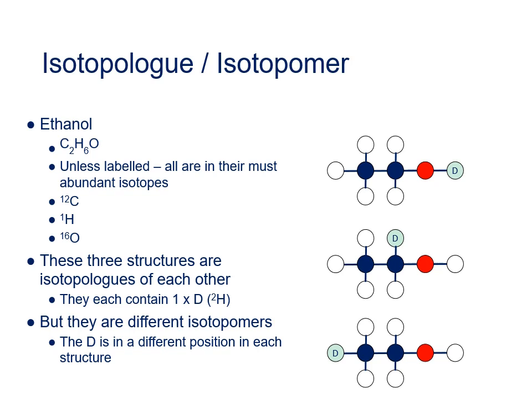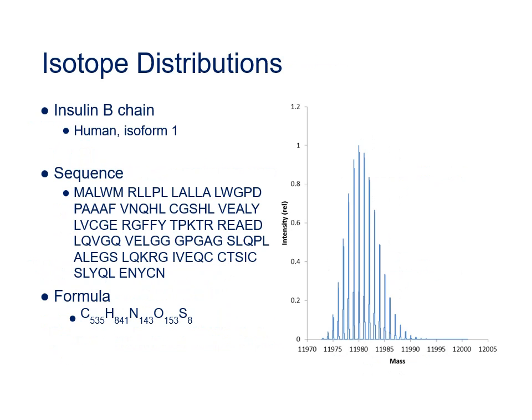So as a reminder, isotopologue means all ions that have the same ionic formula containing the same numbers of isotopes irrespective of their structure, whereas isotopomer means a specific distribution of isotopes within molecules of exactly the same chemical structure. You may well find these 2 terms mixed up in the literature.